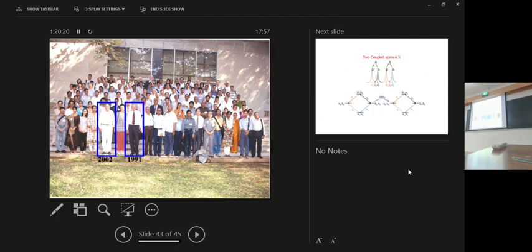So this can be calculated. There are quantum mechanical methods to calculate the coupling constant between these two. You have one nucleus, another nucleus, a magnetic dipole, you have electrons in the middle, then you have the relay through the electrons, so those calculations are possible. But empirically, the trans coupling is larger than the cis.